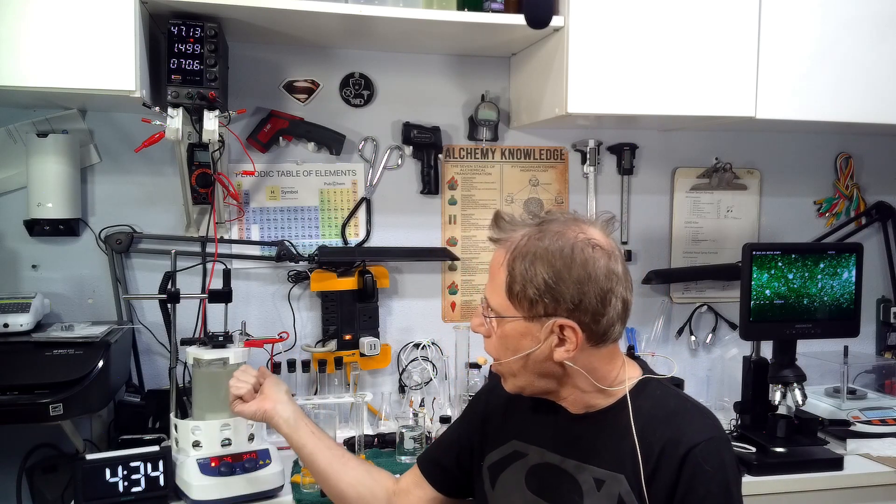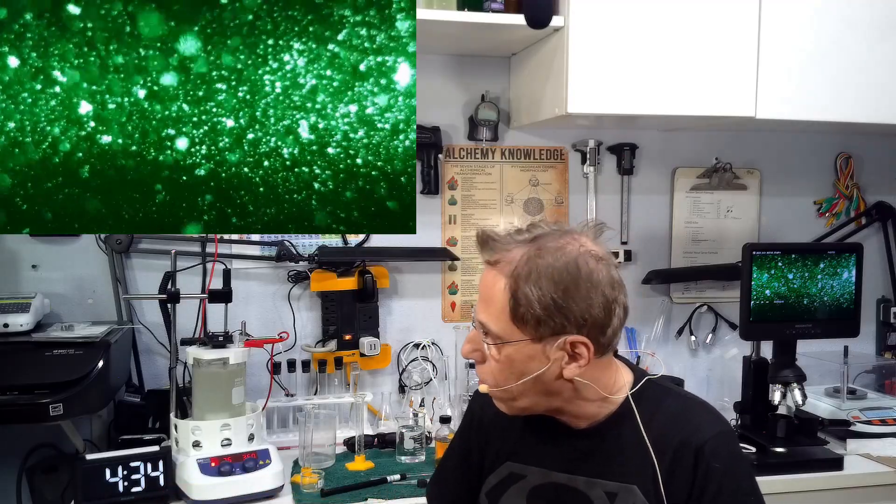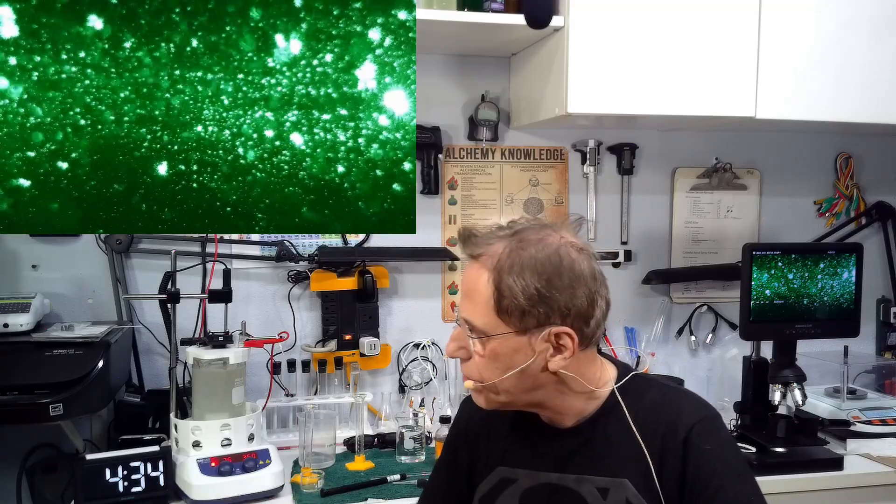We're at four hours and 34 minutes and I've measured the rod. We've lost about two milligrams of material off the rod in four hours and 34 minutes. That comes to about four parts per million solution. I took a picture of what it looks like right now. That is probably about 50% of the way there of what we're looking for.